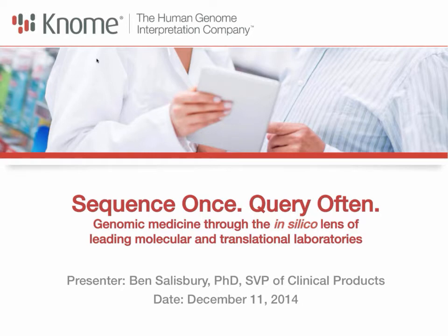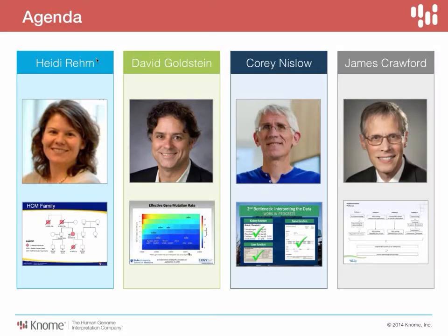Thank you, Jessica, and welcome everybody. So today's topic is about the ability to take a sequence, generate that in the lab, query it immediately for your initial needs, and then query it later for a refined analysis or for a secondary analysis of some kind.